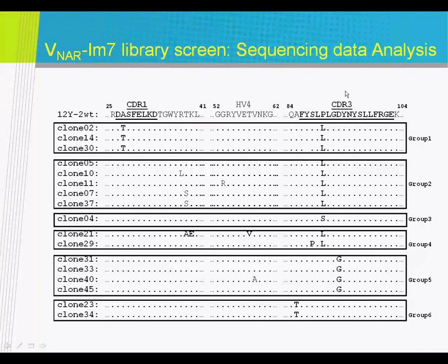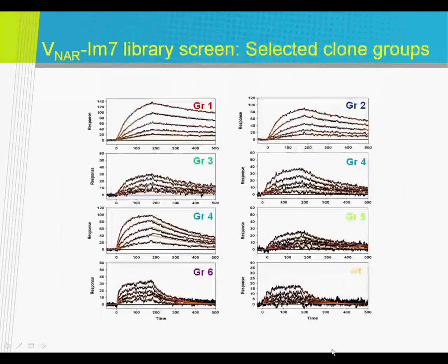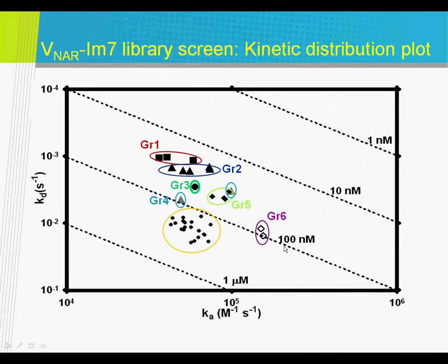We have also found that adding the immunity 7 protein onto the back of our antibody fragment didn't significantly affect the expression and folding of our antibody fragment. That's important. You don't want to add a fusion partner that will destroy your expression. And the fusion partner is relatively big. It's 10 kilodaltons adding onto an antibody fragment that ranges from 14 to 50 kilodaltons. So it's a significant chunk that's being added.